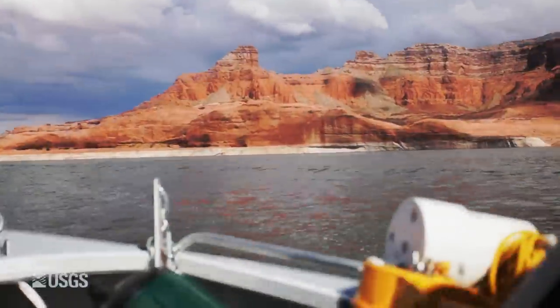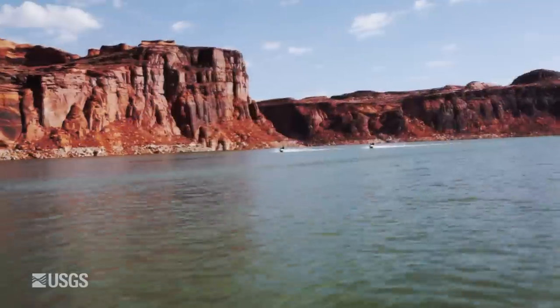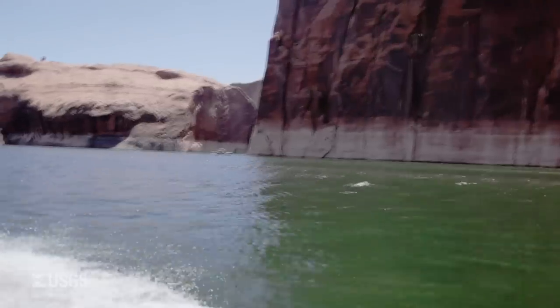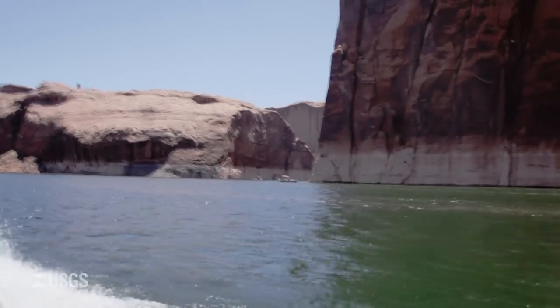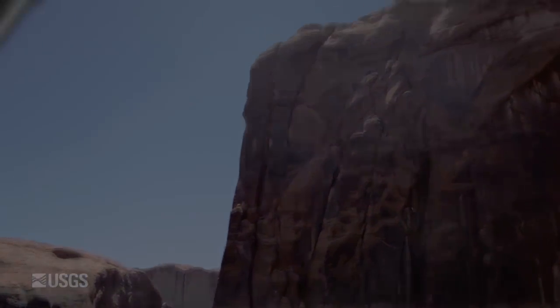After the samples are filtered, this particular sampling is for all the inorganic elements you can think of. We actually analyze for close to 60 different elements. Not all of them are above detection and not all of them are of importance for human health, but there are a number that are. Luckily, values tend to be pretty low.